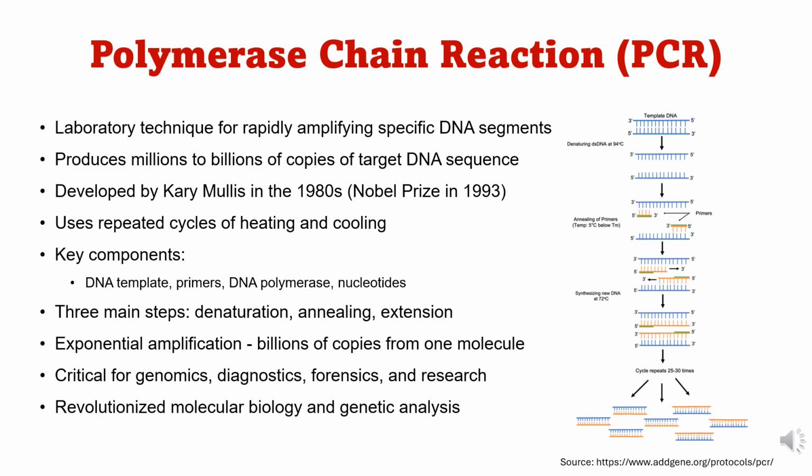comparison with suspect samples or database records, and that is crucial for solving some crimes and also investigating who the suspect is. So these examples highlight the versatility of this method, that is polymerase chain reaction, and it is crucial in addressing contemporary challenges in medicine as well as law enforcement.